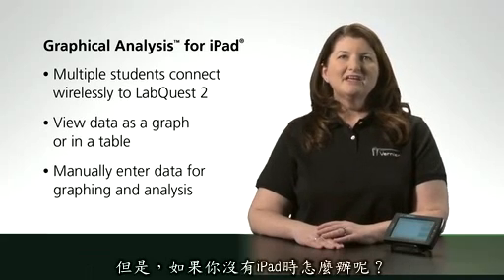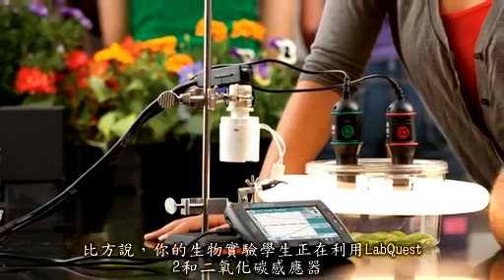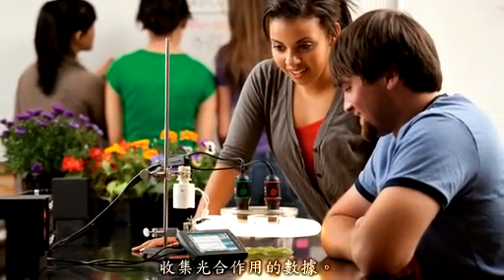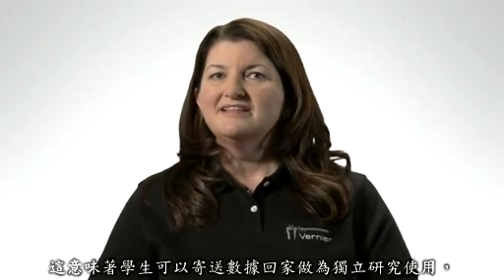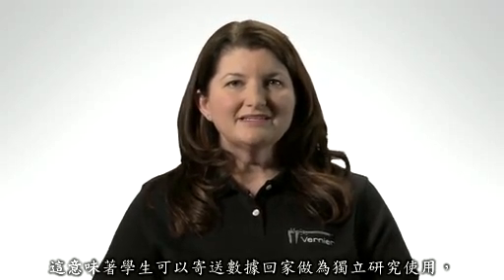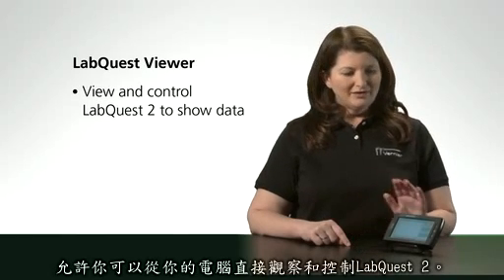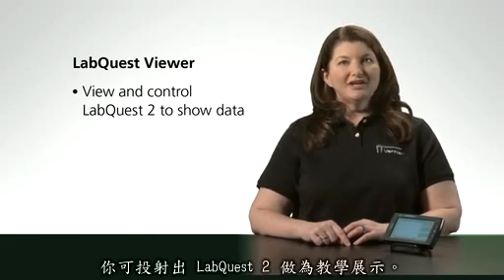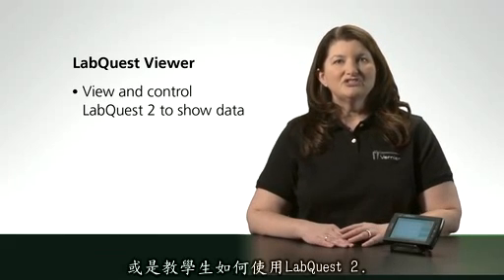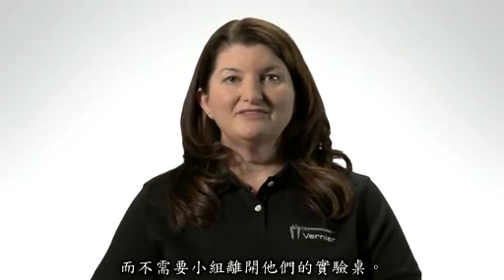So, what if you don't have iPads and your students don't have mobile devices available? You can still take advantage of LabQuest 2's wireless networking. For example, if your biology students just collected photosynthesis data with a LabQuest 2 and a CO2 gas sensor, they can send that data directly from LabQuest 2 to any email address — home for further independent analysis or directly to the instructor for evaluation. Finally, our new LabQuest Viewer allows you to view and control LabQuest 2 directly from your computer. If you have a projector connected to your computer, you can project your own LabQuest 2 as a demo or to teach students how to use it. You could also share class data by projecting from a particular student group without them having to leave their lab table.